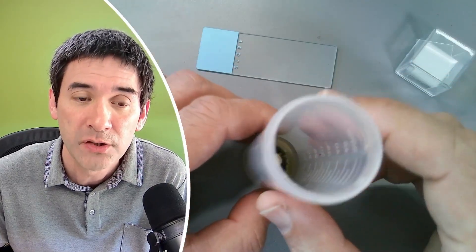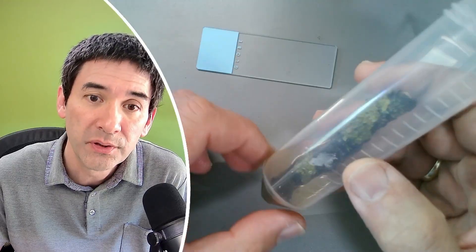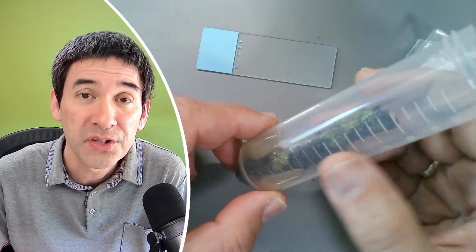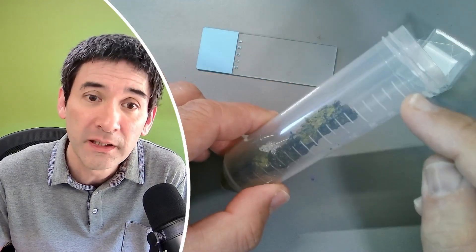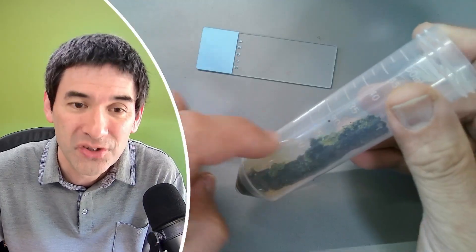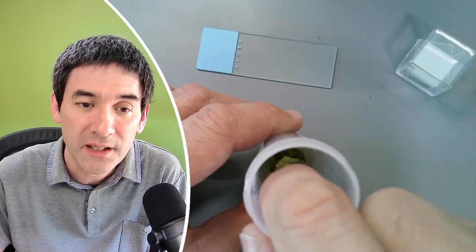This piece of wood has been in water for several days now. When you put specimens into water like this, make sure that you do not submerge them completely, because microorganisms need oxygen as well, and if you cover it completely with water then you're going to cut off the oxygen supply. Just put a little bit of water on the bottom, and by capillary action the water is soaked up into the wood — and now everything is quite ready to be observed.